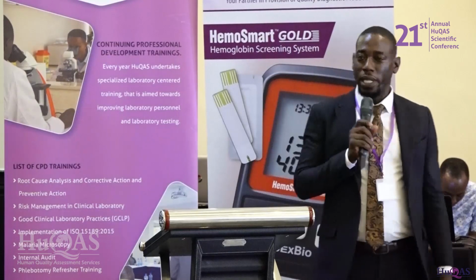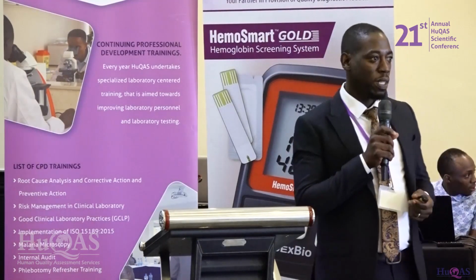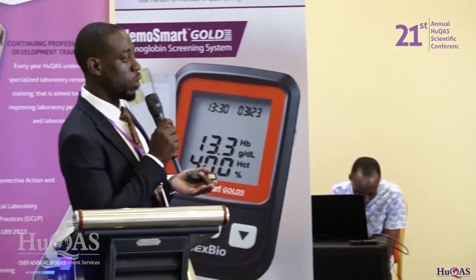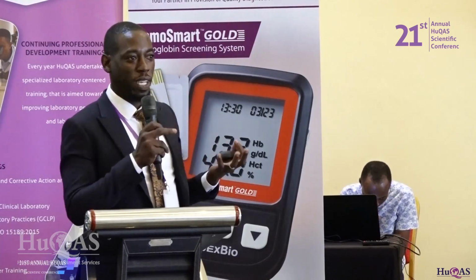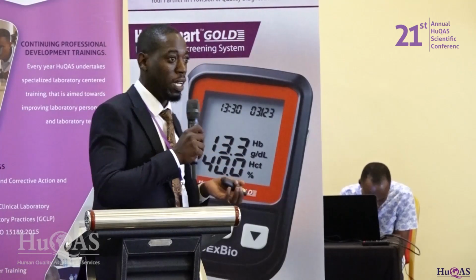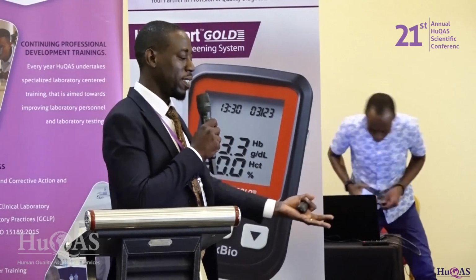This is our introduction slide. We say improved biospecimen handling practices are important for research and medicine. And we know when we keep these samples very well, many researchers do base their findings on the samples we stored. But I can tell you, many times in medicine, therapeutics, and also in preparation of reagents, even the PTs, which we are talking about here as HuQAS, they use the samples we keep in the biorepository. And they just need to classify them, then they give us to do the analysis right together.